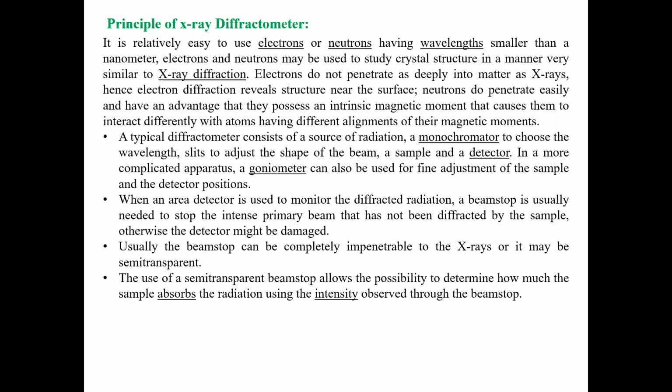Electrons and neutrons with a wavelength smaller than a nanometer may be used to study the crystal structure in a manner very similar to X-ray diffraction.